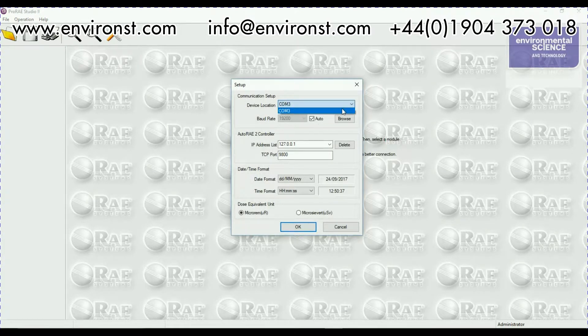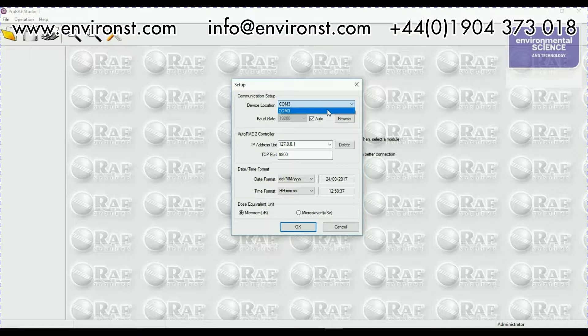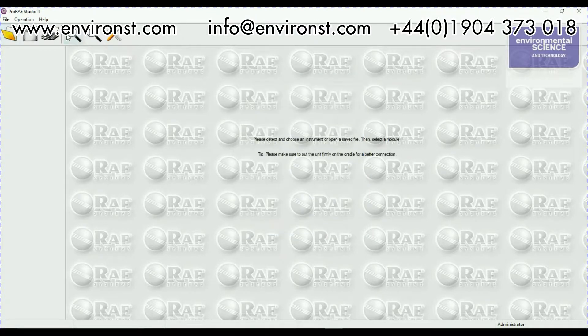what I suggest you do is you go to settings and you check your COM. Now that's the most common area for problems, it's basically the ROM COM channel as SNET did. It should automatically go to the correct one but sometimes it doesn't.